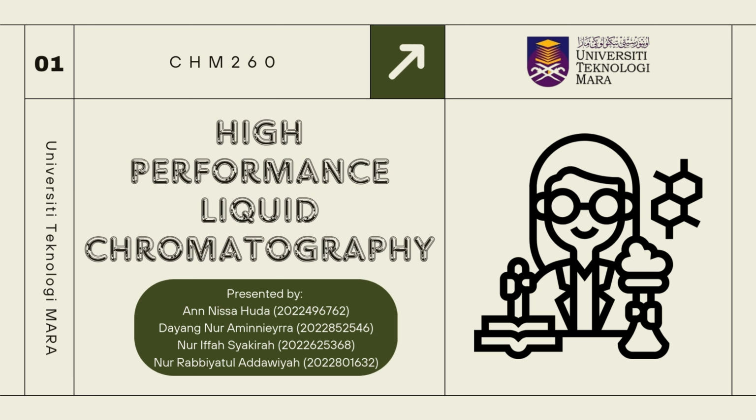HPLC is one of the most powerful analytical techniques in modern chemistry, used to separate, identify, and quantify individual components in complex mixtures. Let's get to know HPLC deeper.